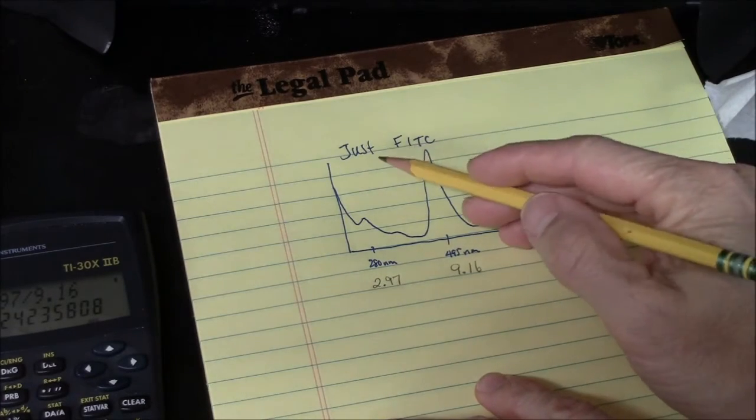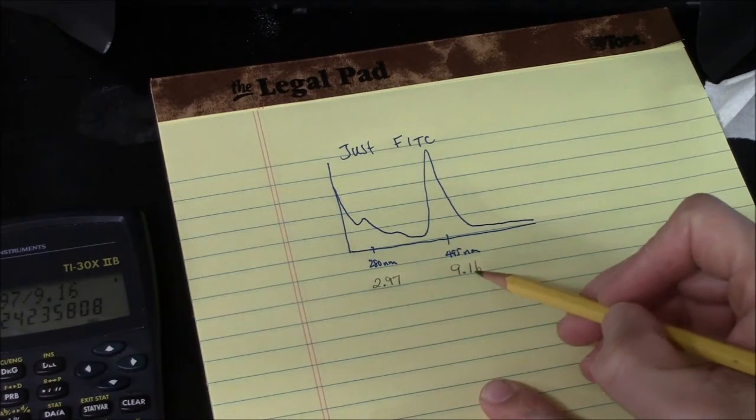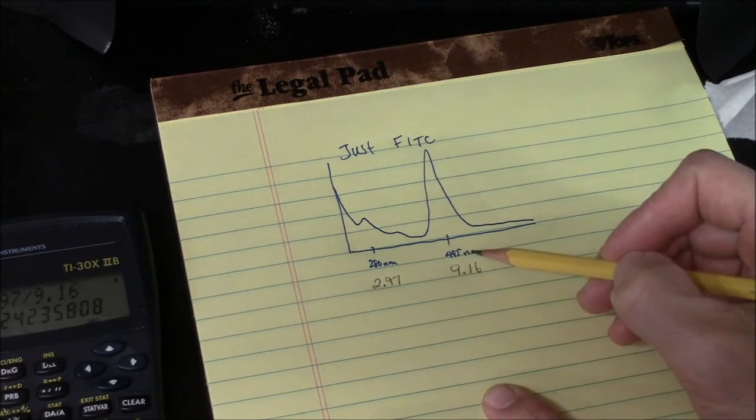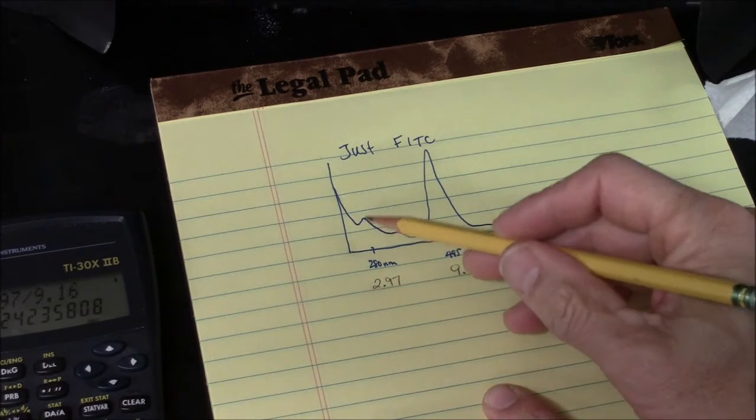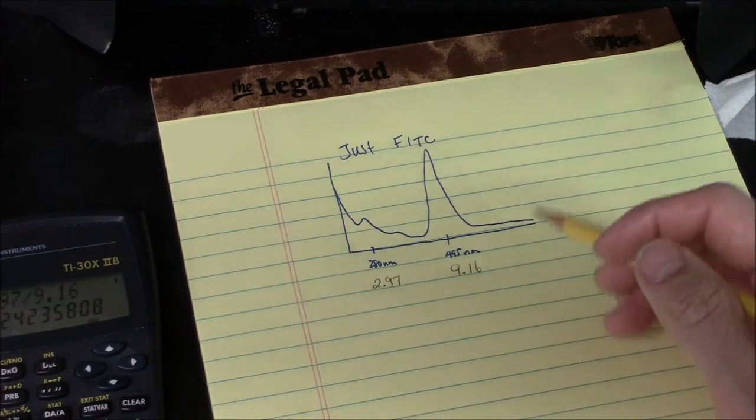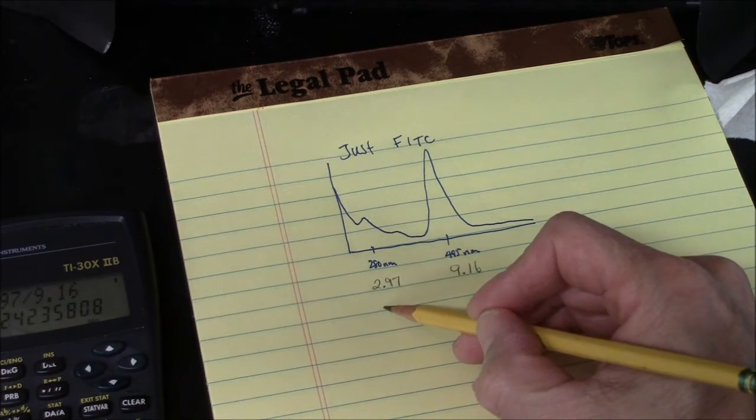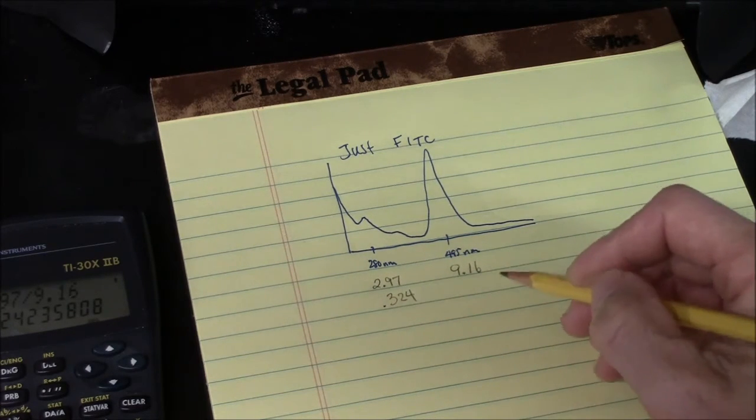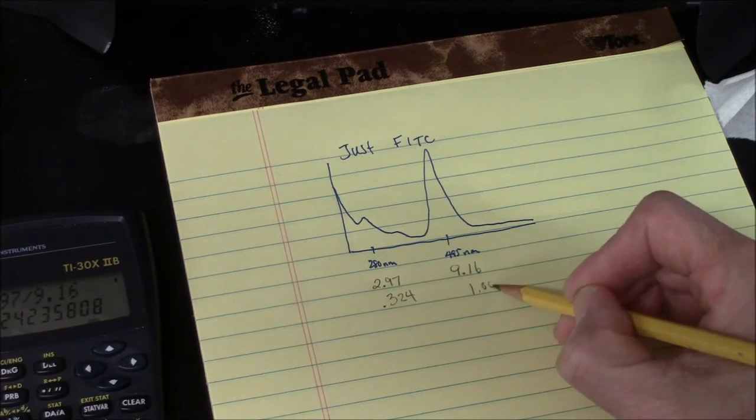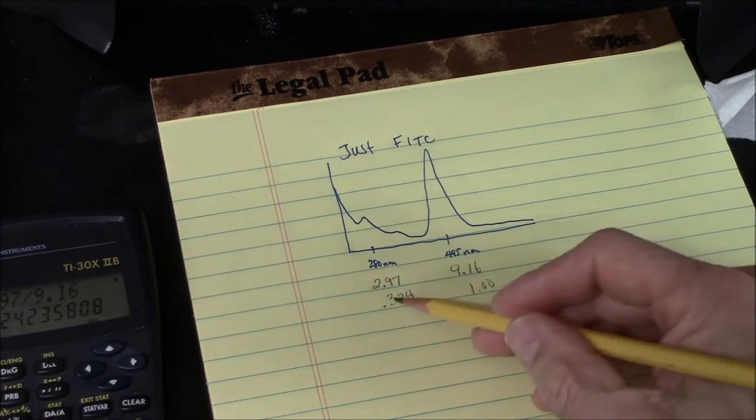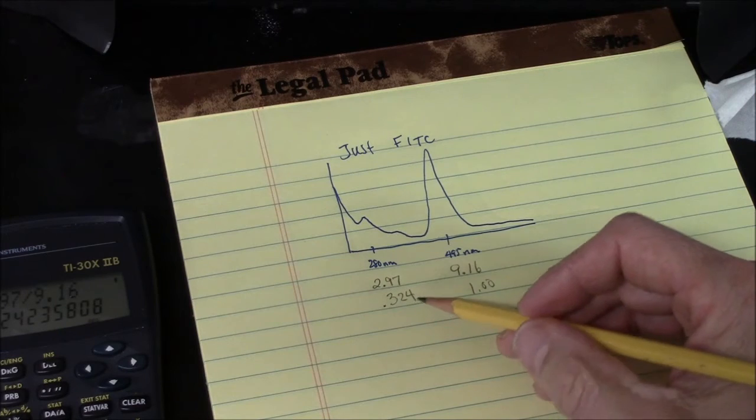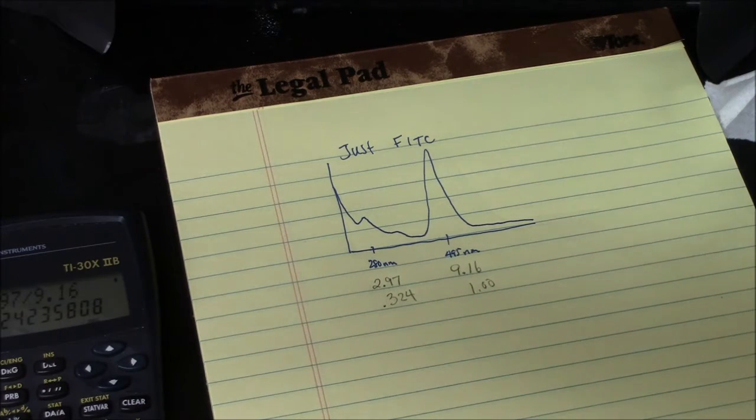When we took the spectrum of just FITC, we saw that the peak at 495 nanometers is significantly taller than this small peak at 280 nanometers. And the ratio we found was 0.324 to 1. So I'll use this ratio now to correct the spectrum of the protein plus FITC.